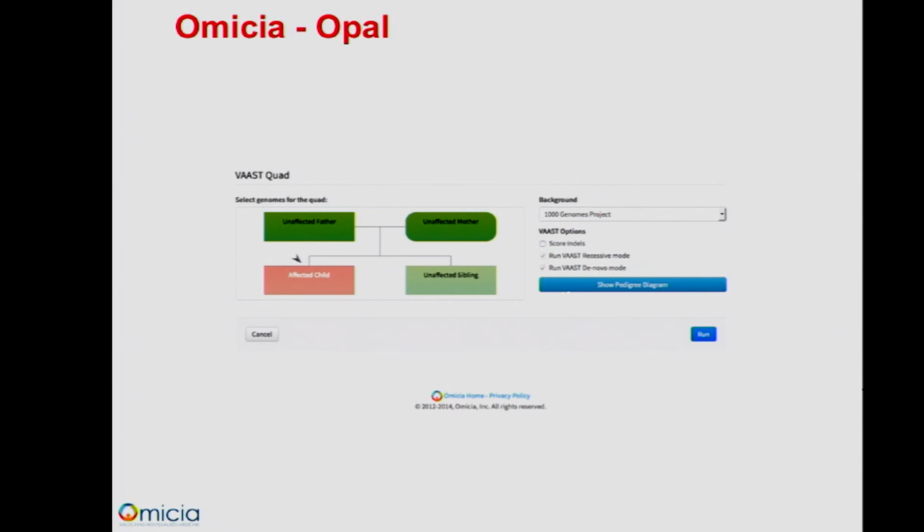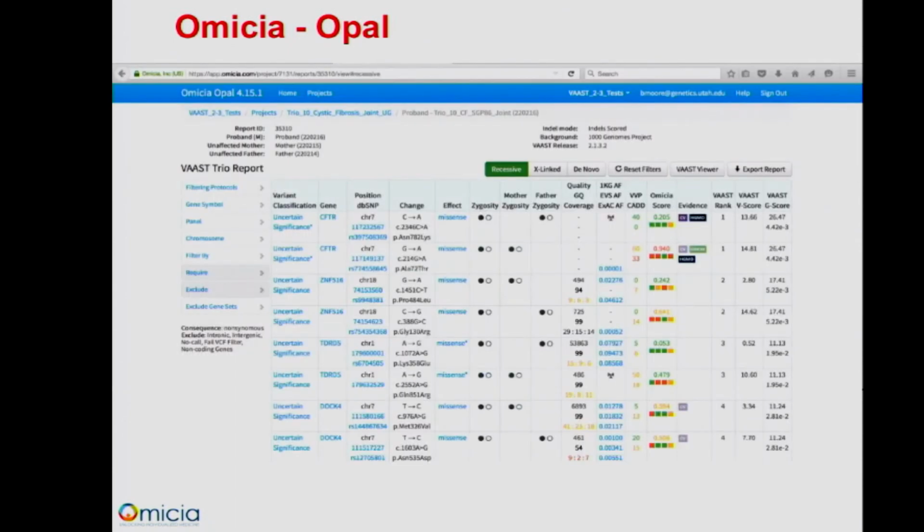And then you check over here the background file that you want to use, you click go and you come back. We've just re-implemented a new version in here based off of VVP for these. You click on it and basically, as you're getting back to the next screen, the run is finishing, and within a minute or so, you can see the output.